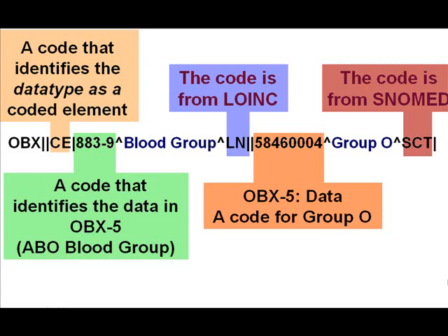So that's illustrating the potential division of labor between LOINC and SNOMED in this example. Questions about that or comments? And what was the reasoning behind deciding to only do the groupings and not the actual data?